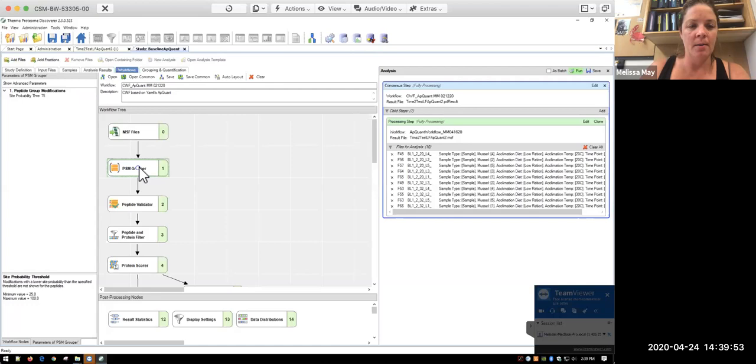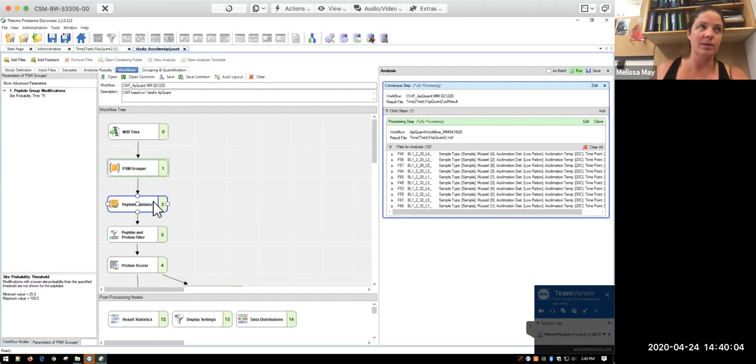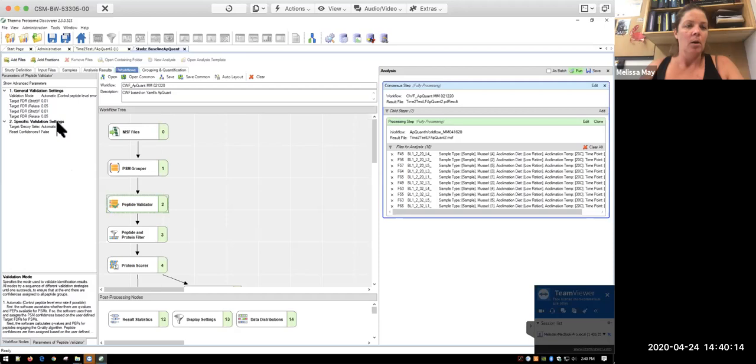In terms of our peptide spectral match grouper, it's going to group anything that was redundantly identified into peptide groups. So that's one of those different nodes that you have there. So you have your peptide spectral matches, and there's multiple of those that will go for a given peptide. And then those peptide groups will feed into your protein groups and so on and so forth.